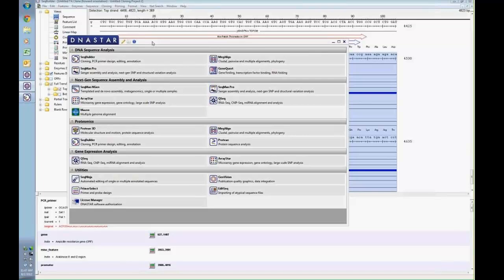Whether you're specifically working with single nucleotide polymorphisms or just looking at ambiguities, if I go to the SNP report, it will show you those ambiguities or differences that exist between the reference and the sequence. If I expand on this, what this SNP report is showing me is the actual contig position. So if a reaction went over the ends of your reference, it's going to show you the contig position. It's also going to show you the reference position.